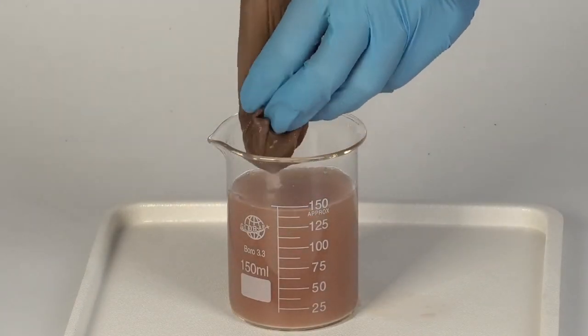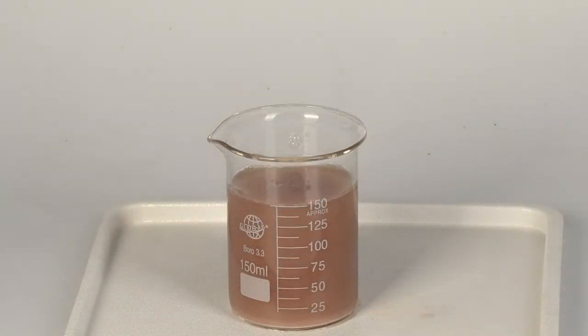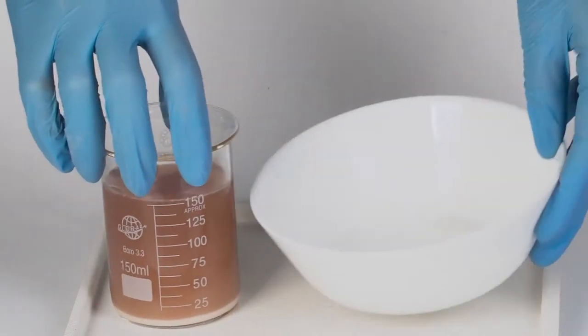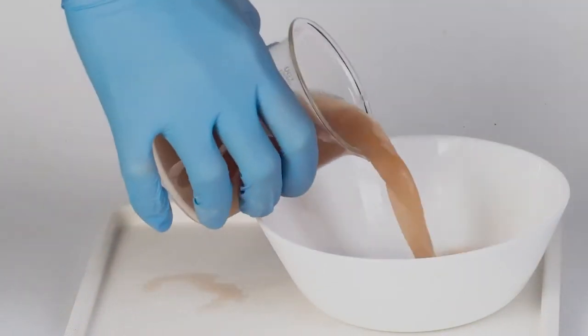Wait for about five minutes to let the precipitate settle on the bottom of the beaker. This precipitate is starch, which will be a base for our plastic.